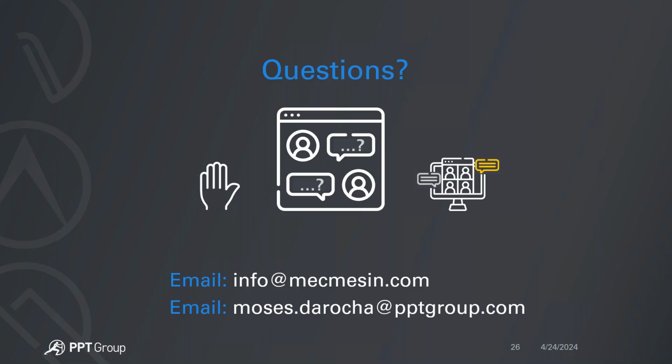Unfortunately, no, because your 2.5 DVU was designed specifically for force and materials testing, so compression and tension tests only, no torque at all. Even though it uses the same software to configure testing applications, whether they're ASTM test standards or ISO test standards, it's not currently designed to do any torque. However, if you purchased a Vortex Pro or Helixa Pro, you'd be using the same software to configure your torque testing applications. But your current DVU does not perform any torque testing applications at all.